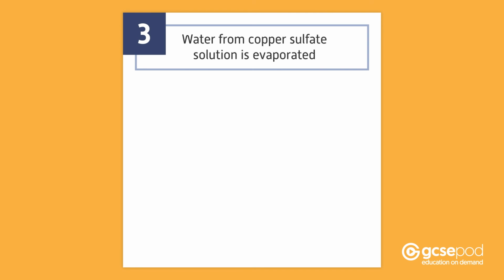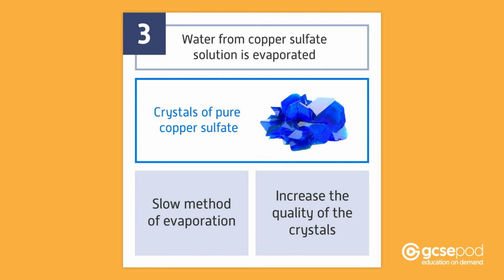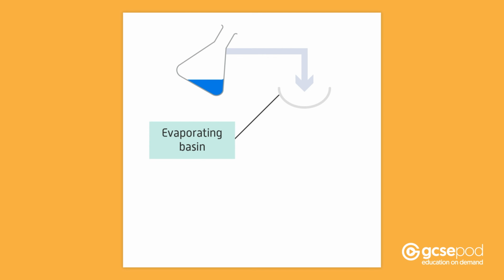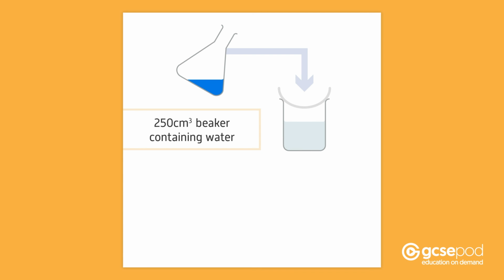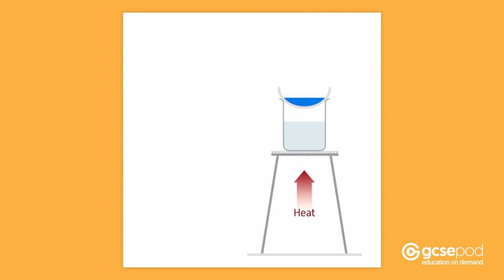Step 3. The water from the copper sulfate solution is evaporated to leave crystals of pure copper sulfate. A slow method of evaporation will increase the quality of the crystals. Pour the filtrate from the conical flask into an evaporating basin. Evaporate the solution gently using a water bath. You can create a water bath using a 250 cubic centimetre beaker containing water, placed on a tripod and gauze, and heated from below using a Bunsen burner. The evaporating basin sits on top of the beaker.